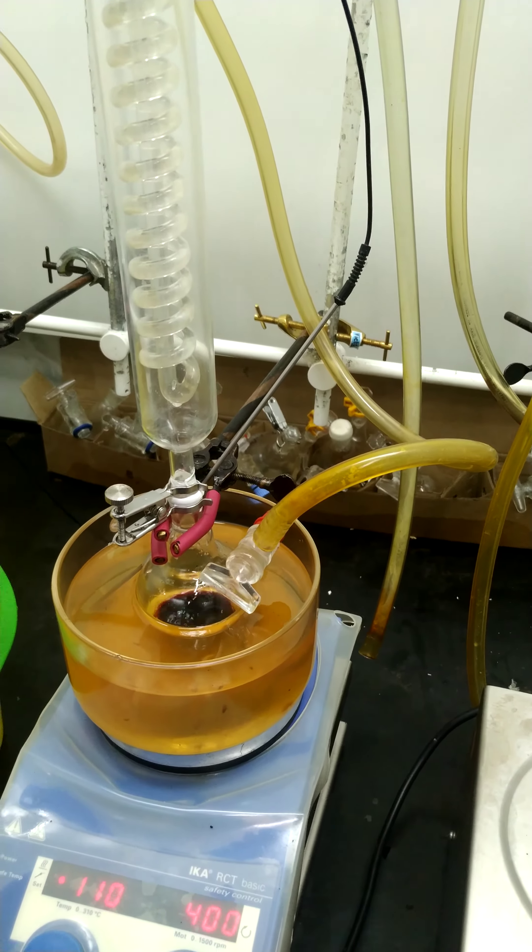Earlier when we used to be in school, we used to see reactions written in textbooks. On the right side there's the product, on the left side the reactant, and in between there's an arrow. On that arrow, there used to be 'reflux' written. Many of us were wondering what reflux is, so I thought I'd explain it to you guys.